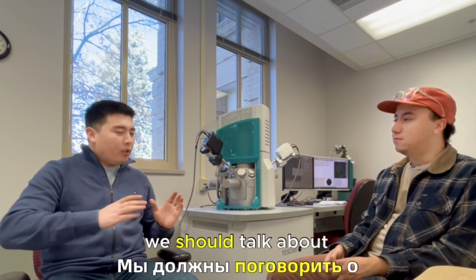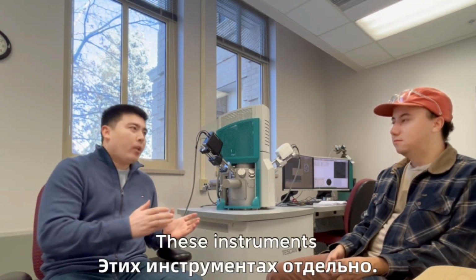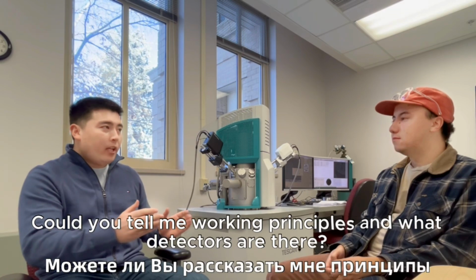So anyway, we should talk about these instruments separately. Let's begin with SEM. Sure. So could you tell me the working principles and what detectors are there?